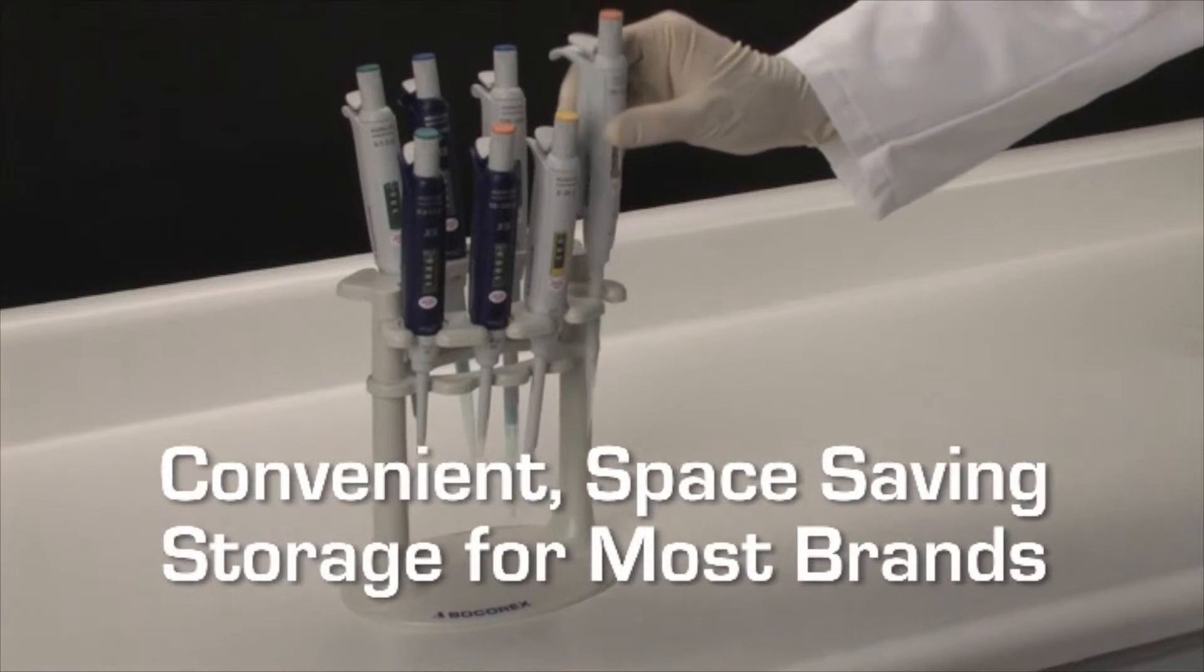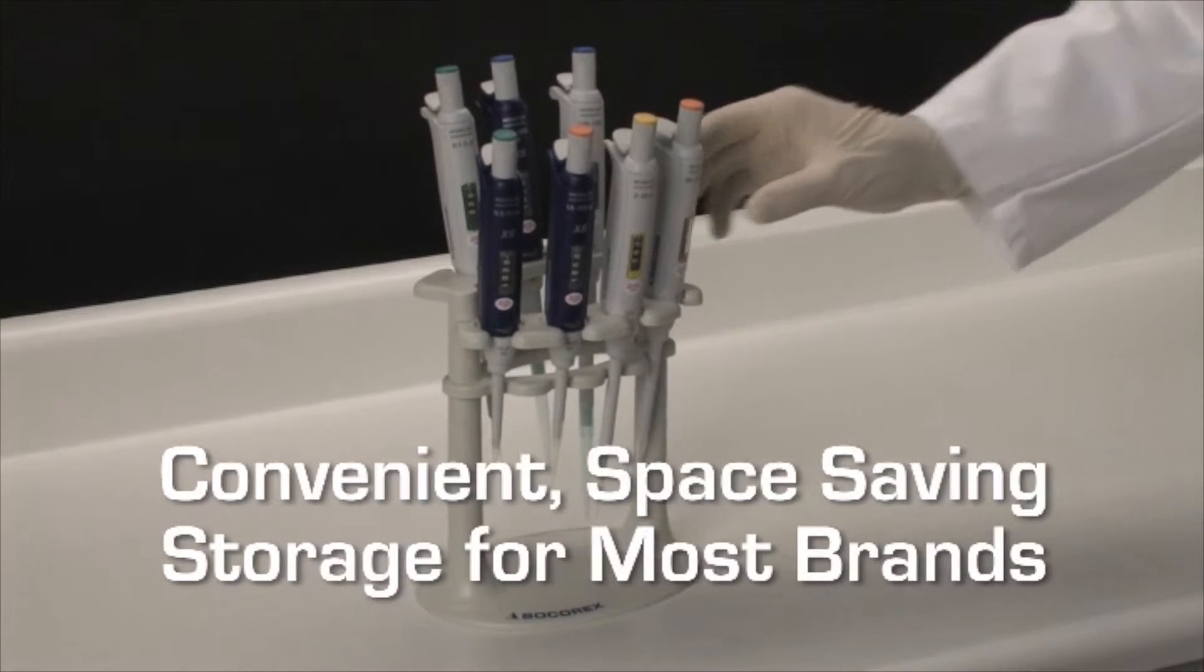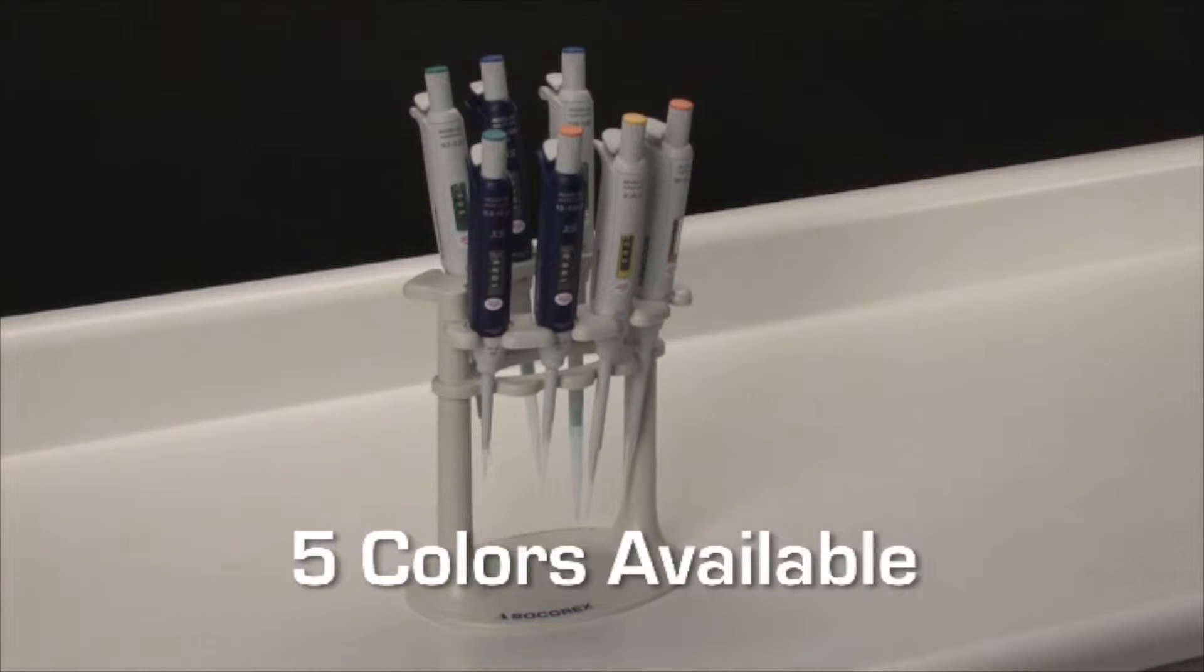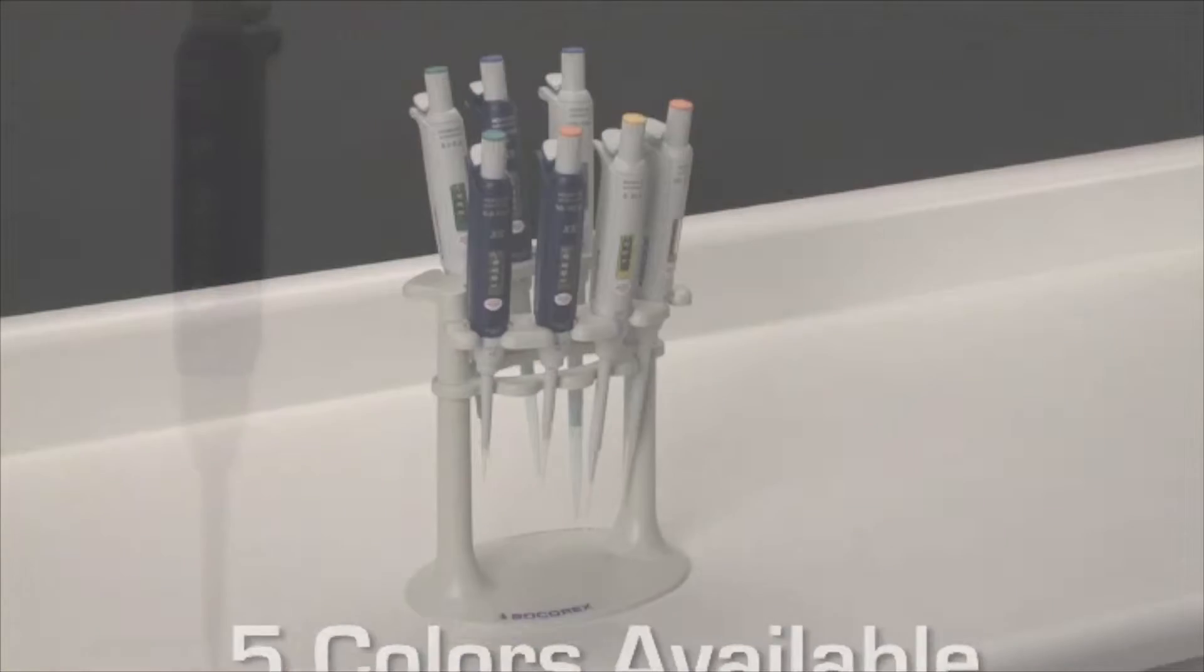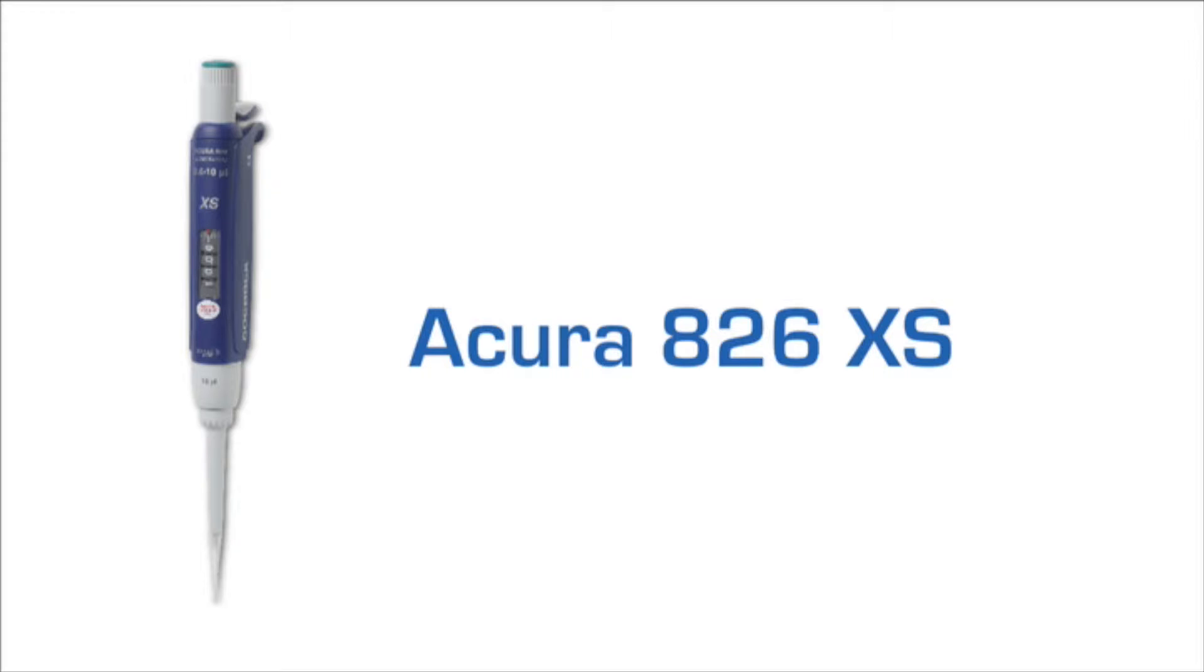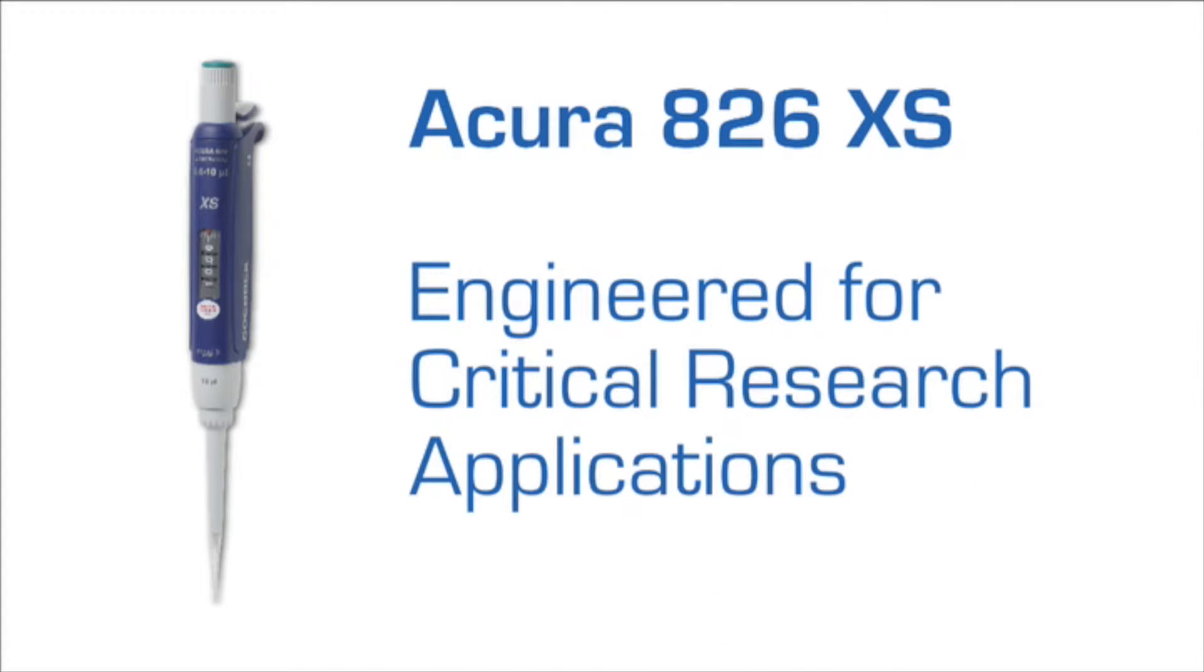A selection of stands for all models, including other brands, is offered to enable convenient, space-saving storage when not in use. The new Acura 826XS is specifically designed for research applications to make working with critical samples trouble-free and more precise.